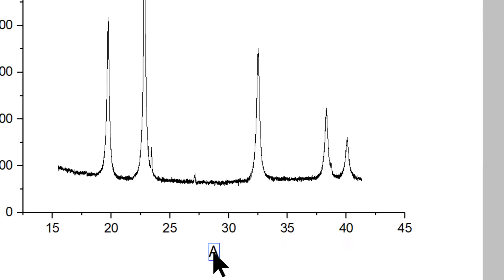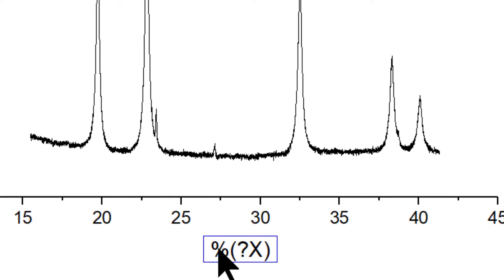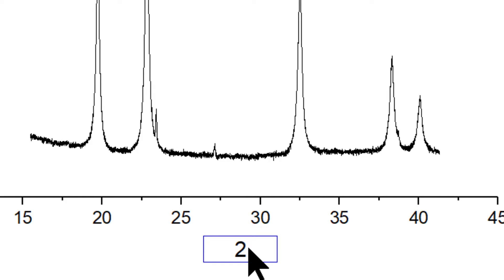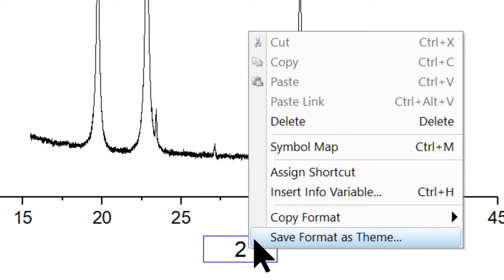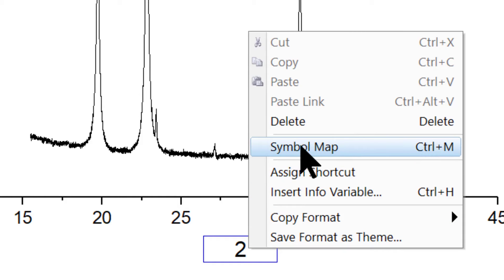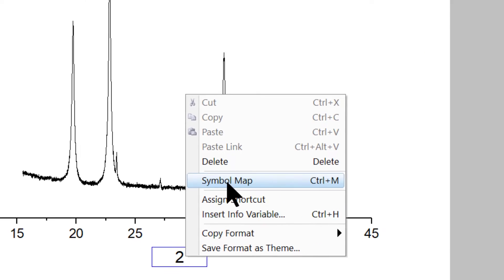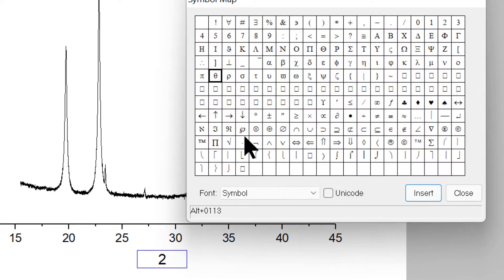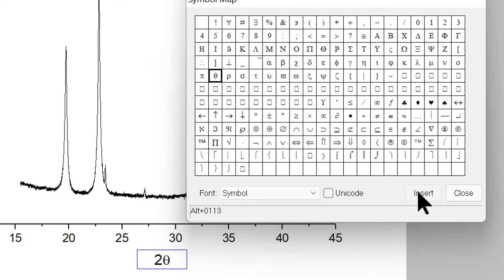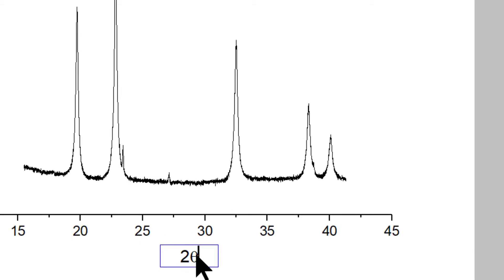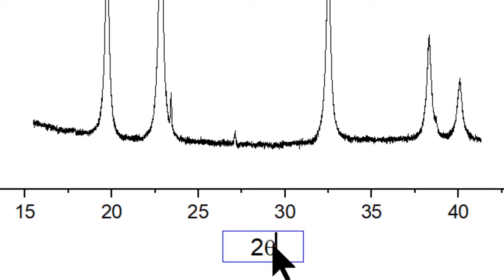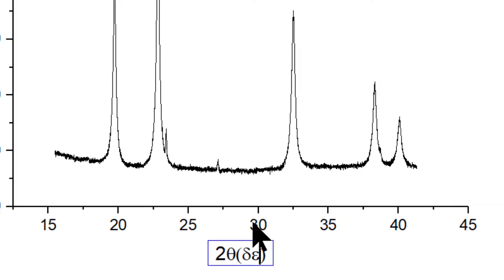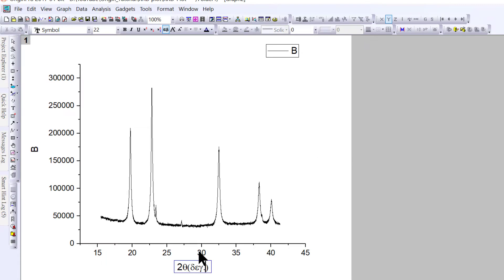This needs to be changed. For the x-axis, type 2. To write a symbol, right-click and click on the symbol map. You can see different symbols. Click on theta, insert, and close the window. Then add a bracket and write degree.